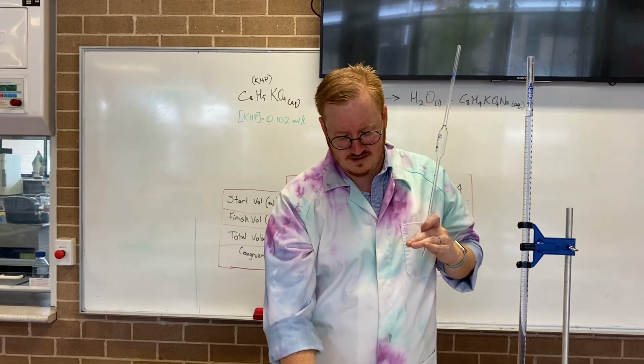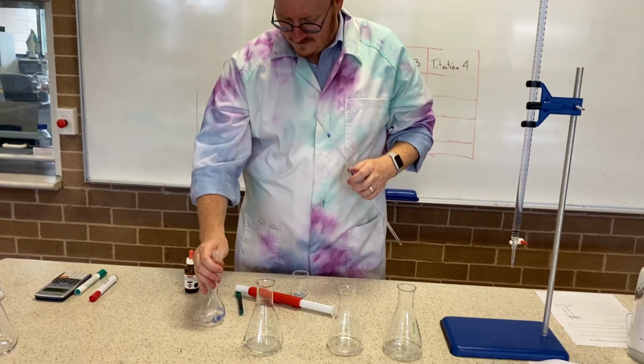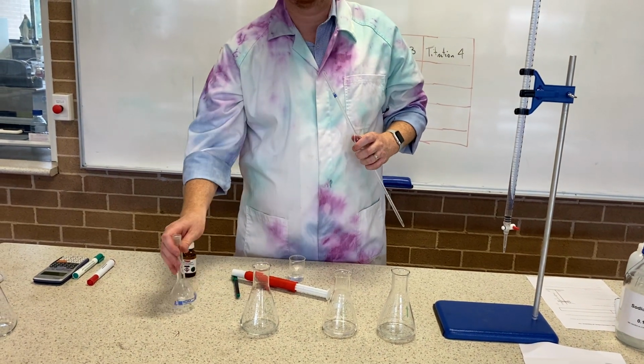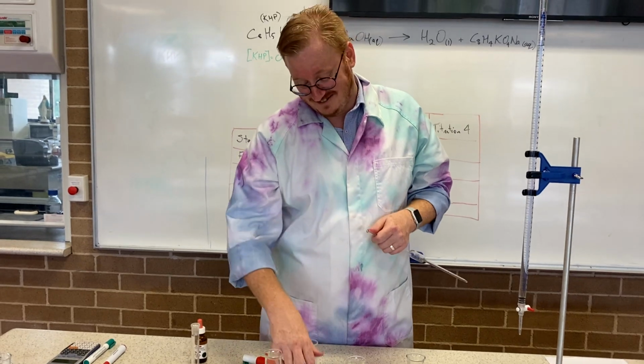All right. One more to do. Top up the volume. What's that song? Pump up the volume? I don't know. No idea.